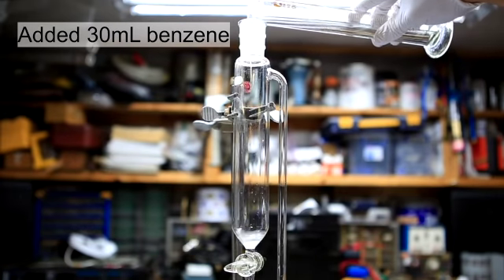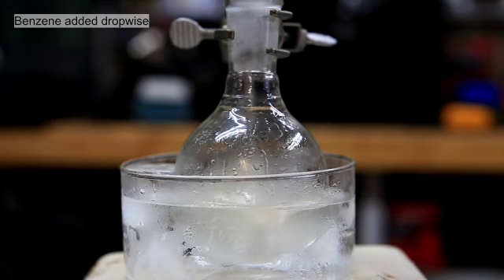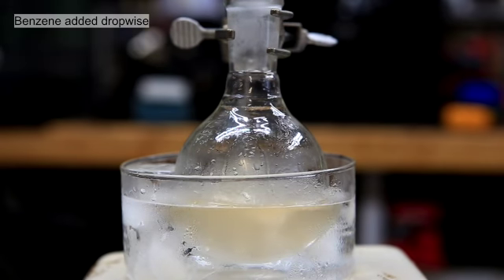To an addition funnel was added 30 milliliters of benzene. While the acid mixture was cooled in an ice bath, the benzene was added dropwise. It is important to keep the temperature below 55 degrees Celsius at all times.